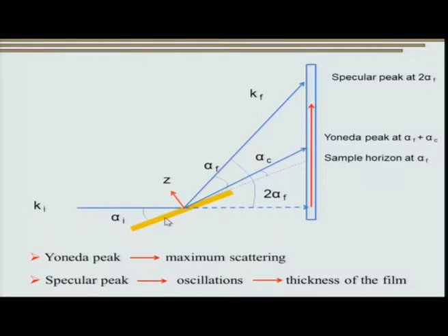So, what we see is there is a specular peak, right. Now, the specular peak, as I hope you appreciate, gives you a lot of information. This is all along z, right. So, this is qz and this alpha f that you see is along qy. So, this gives you the in-plane information in the reciprocal space, while qz gives you out of plane, right.